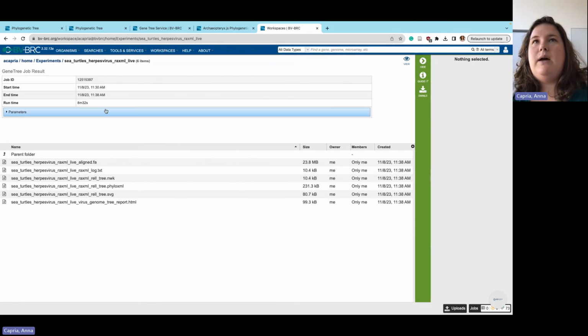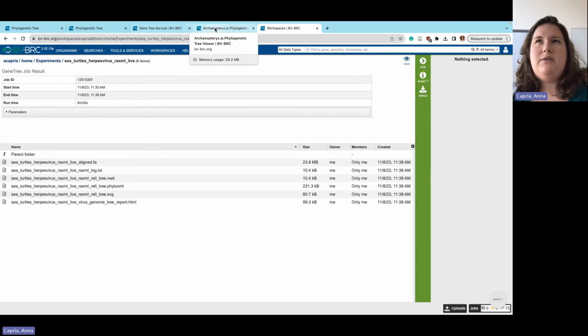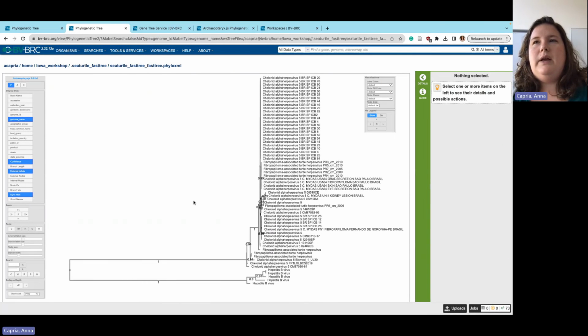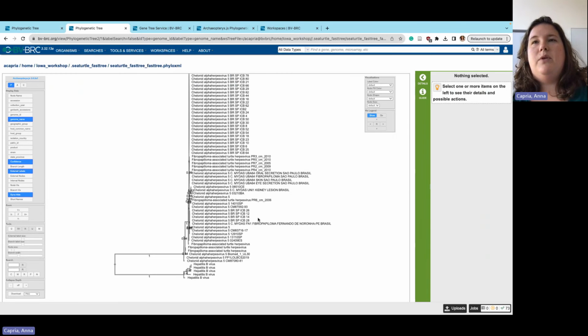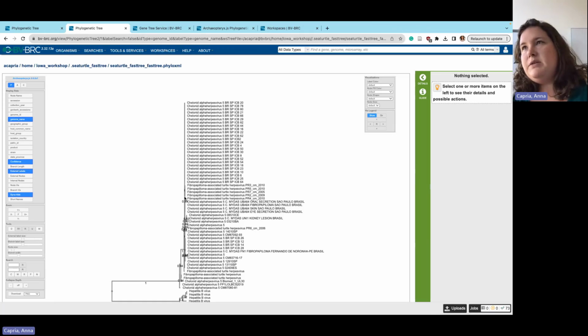The question about your view being saved: it does have some memory, so I can't promise that it'll be perfectly how you saved it, but it's kind of cached with the latest settings that you used. Like before we started, I moved out the x-axis a lot, and that's why the x-axis looked pretty big on all of them. Before I'd done that, they all started pretty flat, so it does save some things like that.